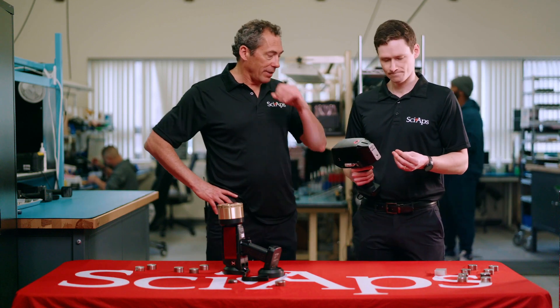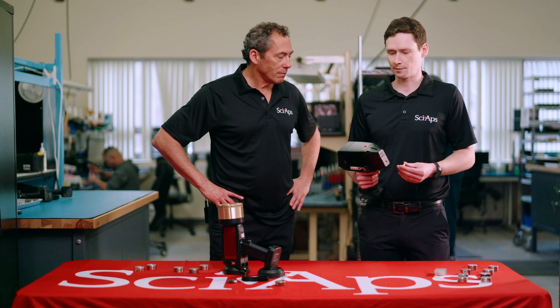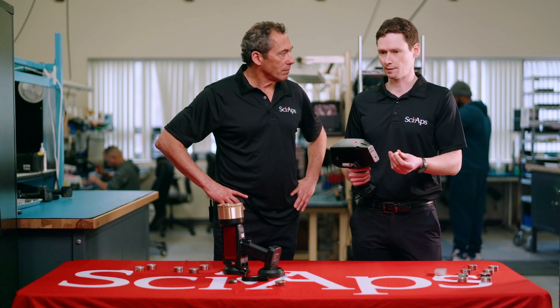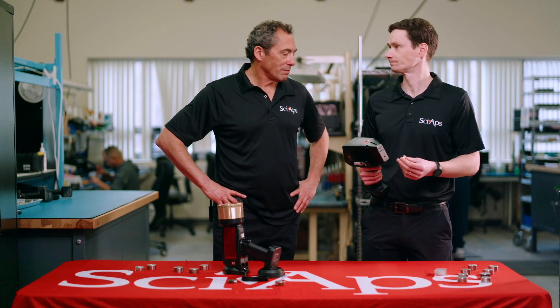Is pressing the pellet a pain? Not too bad. You get a press — manual or automatic — fill a little cup, press it down with a bunch of force. It takes a couple of minutes and you're good to go.